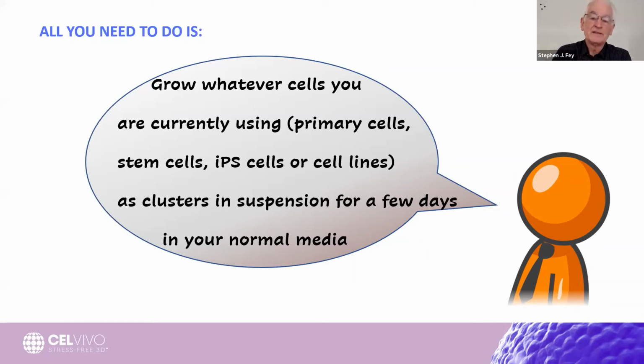If your differentiation process needs growth factors, then of course you add them, but I'm trying to stress that you should repeat what you're doing normally, but just do it in 3D.